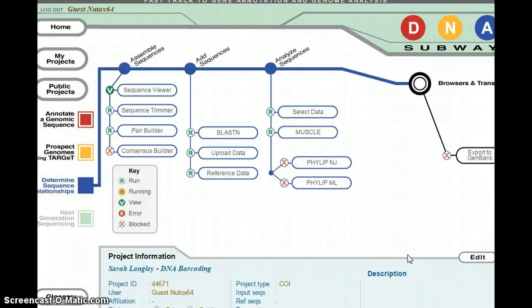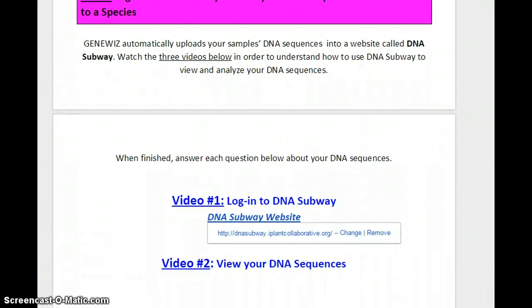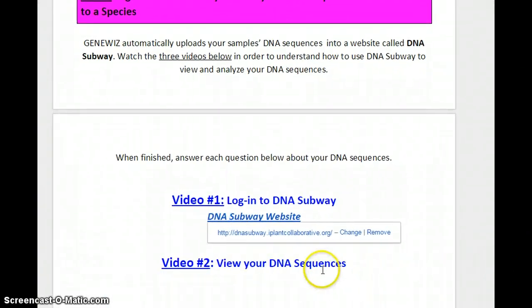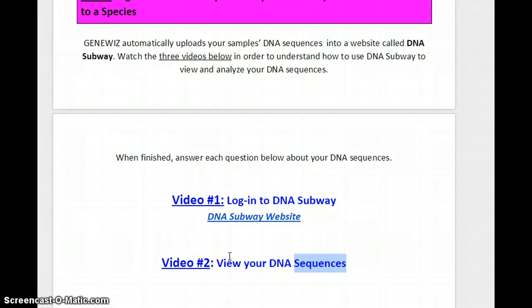Here you are, now logged into DNA Subway. Your sequences are now uploaded. At this point, you're ready to watch video number two, which is how to view your DNA sequences. Go ahead and click out of this video, log in to DNA Subway, then click on video two.